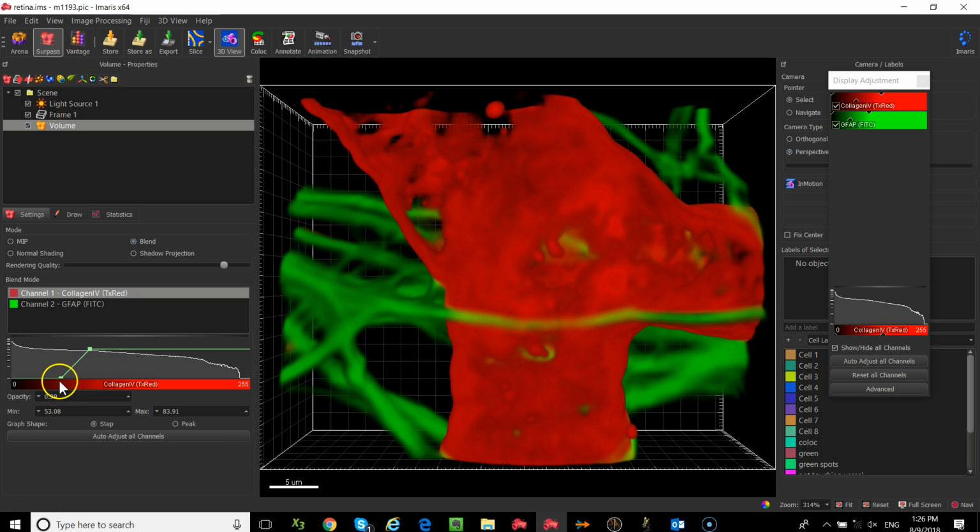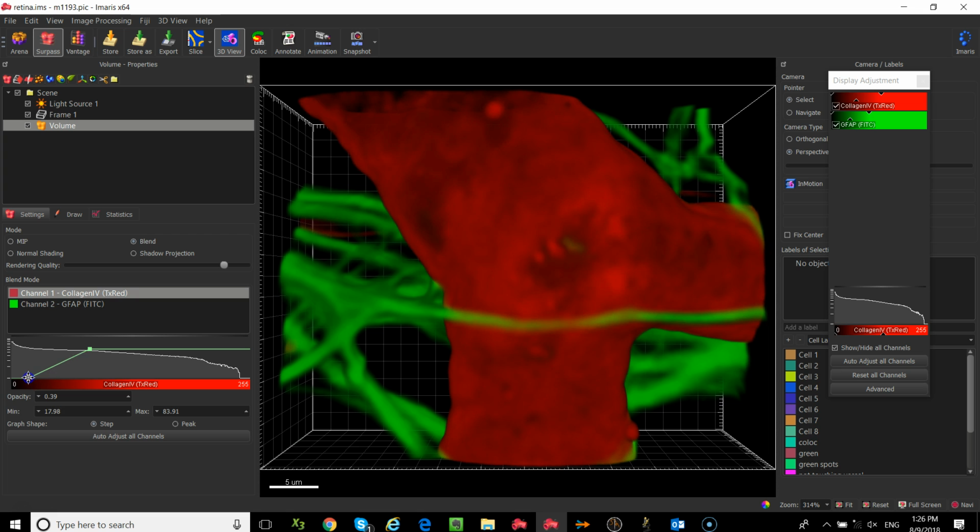structures. Okay? Now you'll notice I just pulled the whole slider down, which will allow you to set a particular gradient. But for now, we want to just focus on the fact that up and down is your opacity, and then depending on the structures of interest, you can move it from left to right to get different intensity values.